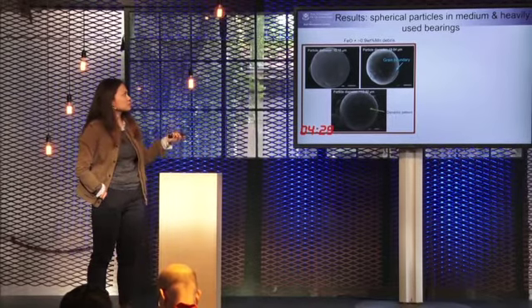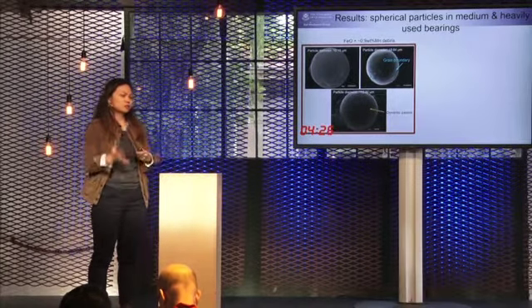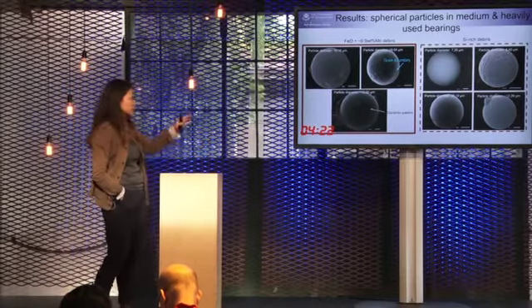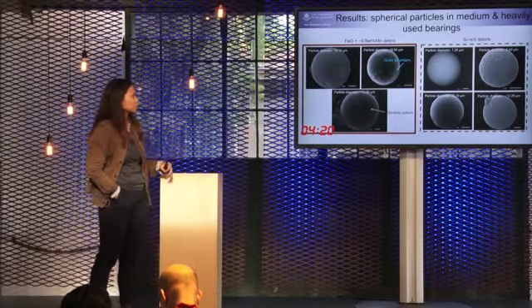The other sphere particle we found that has a smooth surface is the external wear, which is mostly quartz or silicon-rich debris. The only way to distinguish them is to do chemical analysis. And you see with the silicon-rich particle, there's no dendritic pattern and no grain size pattern that you can see.